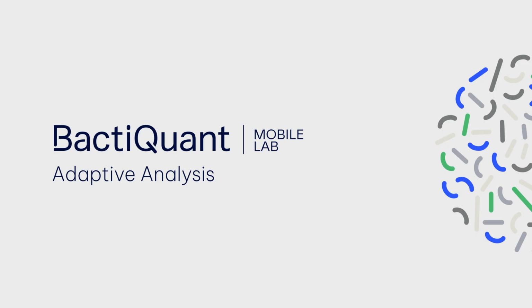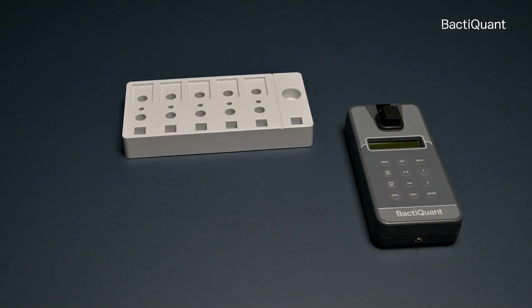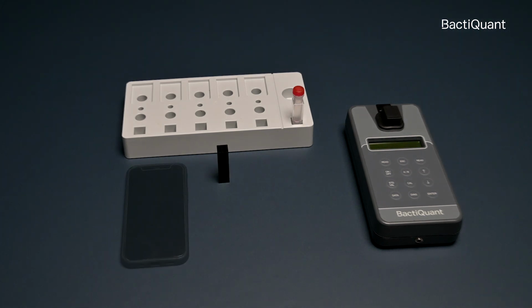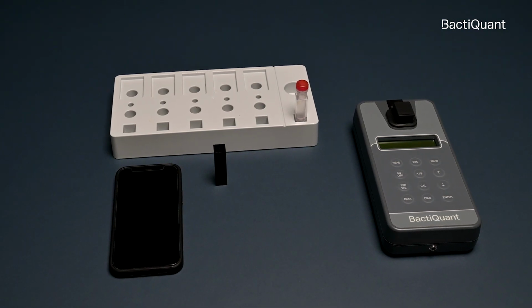Welcome to this video manual that'll take you through how to make an adaptive analysis. Start by calibrating the fluorometer. You need a fluorometer, analysis rack, calibration standard, an empty cuvette, a black cuvette, and a smartphone. Make sure all chemicals are equilibrated to room temperature.